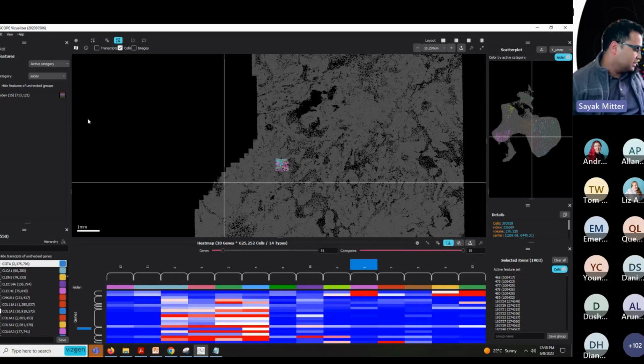There are methods that I know that you can definitely analyze out of the visualizer, and you can bring that data back in with your annotations and re-import it back. I'll have to give you the full path of how to do that, the workflow for that. I do not have that at the moment, but such an analysis is, to the best of my knowledge, possible.